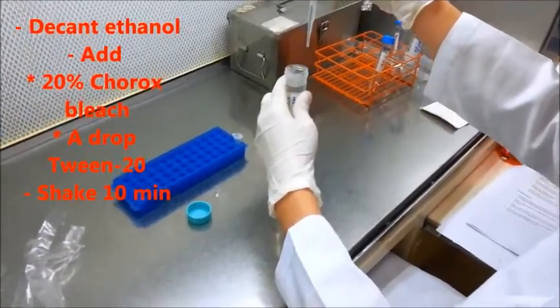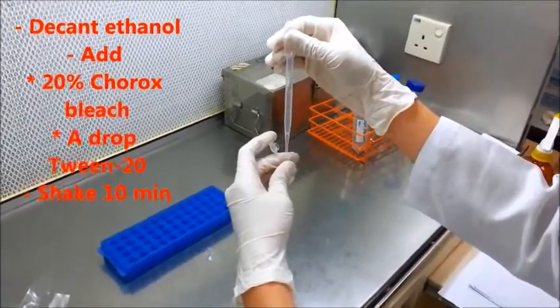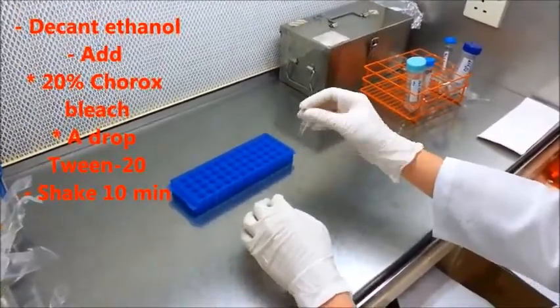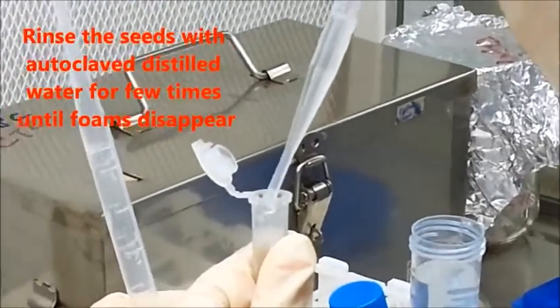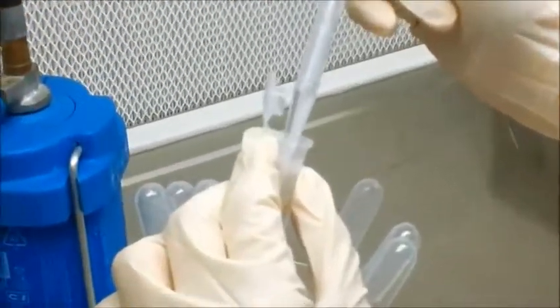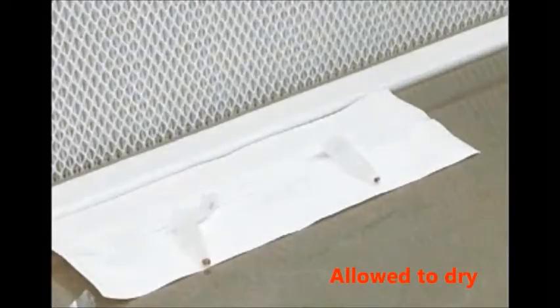Then the ethanol was decanted. 20% Clorox bleach with a few drops of Tween 20 was added and left to soak for 10 minutes with constant shaking. The seeds were rinsed 5 times with autoclaved distilled water. Then the water was decanted and the seeds were left to dry in the laminar air flow. The seeds were now ready for in vitro culture.